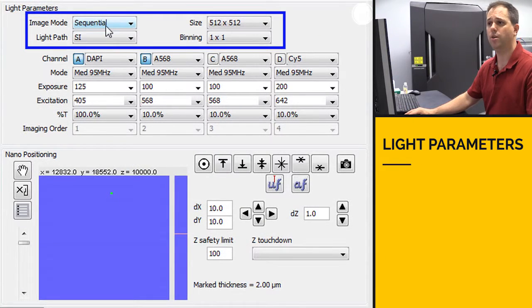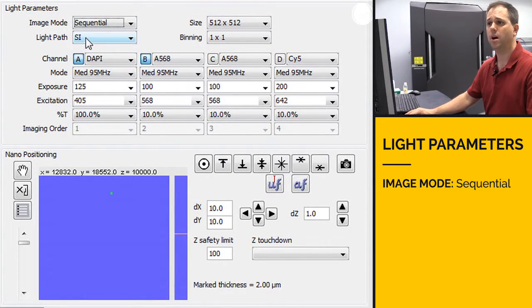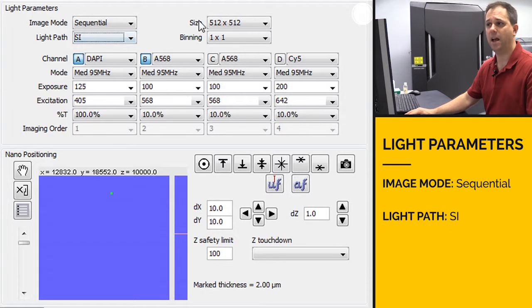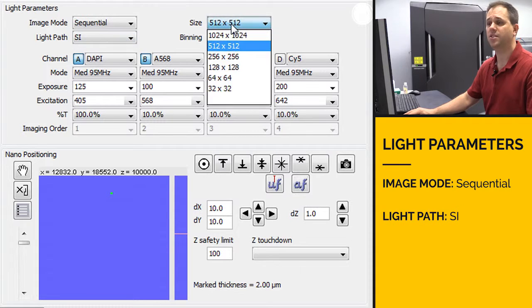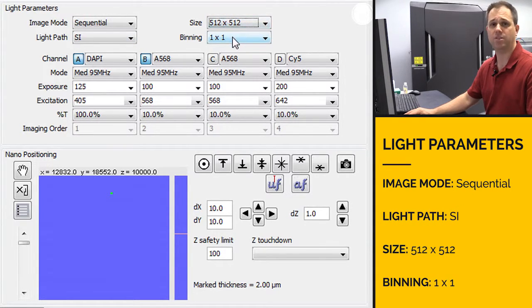The first thing is under image mode, you have sequential. Under light path, you want to set it to SI. Size is going to be 512 by 512, and then binning is going to be 1 by 1.